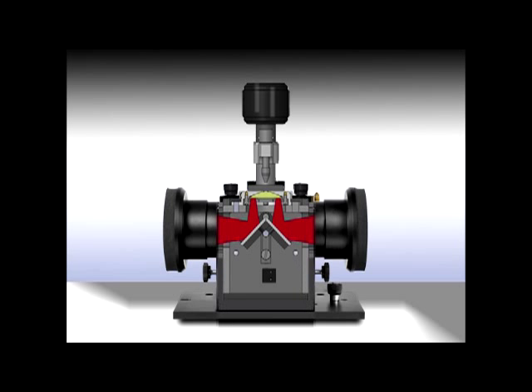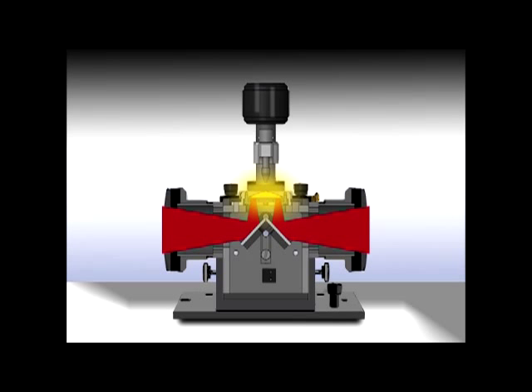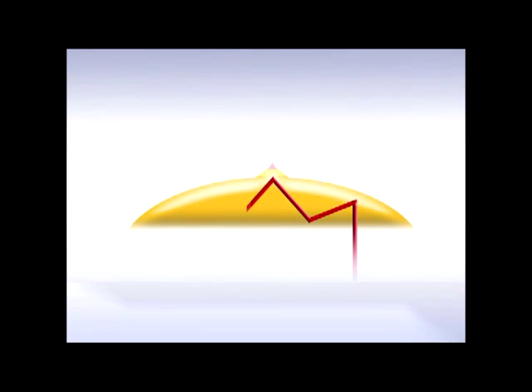We use a dome-shaped optical crystal, precision cut and polished using state-of-the-art diamond-turning technology. The optical element efficiently focuses the infrared beam at the sampling position.